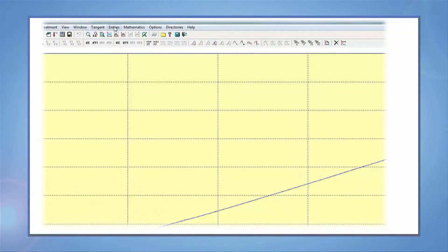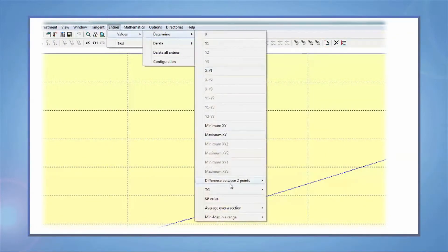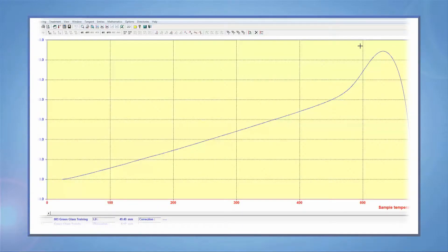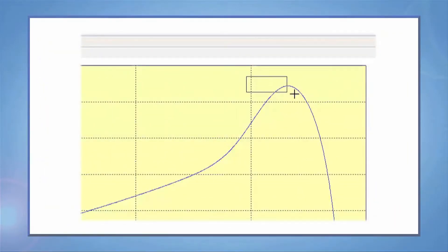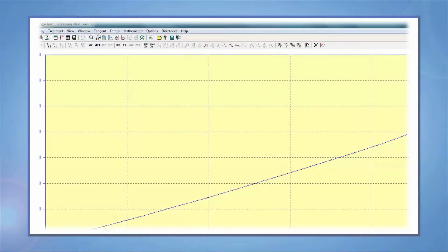If you want to find the softening point on the graph, then you need to go to entries and pick softening point. Take your mouse and go over the area that you're interested in. Keep your finger on the left button of your mouse and drag a rectangle on the desired area to find the peak of the curve.